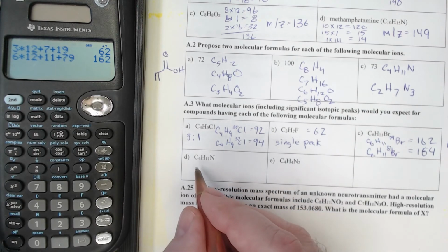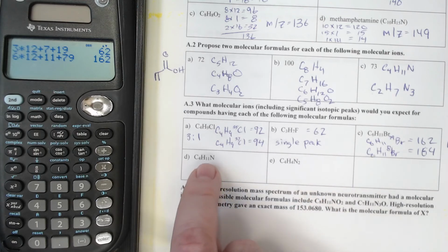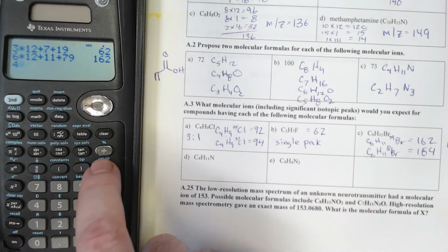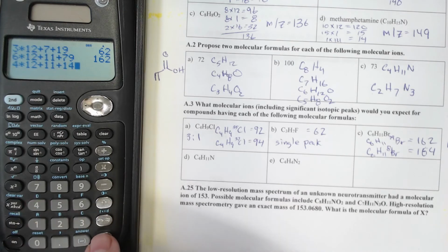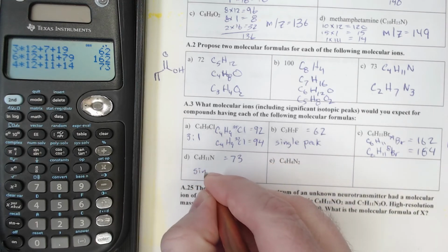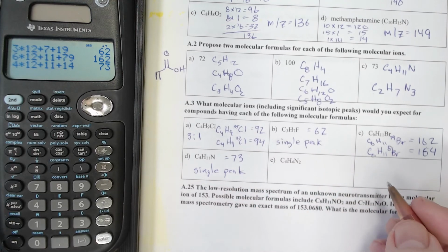All right, next, let's look at this one, C4H11N. This should be an odd number because it has 1 nitrogen in it. So 4 times 12, that's 48, plus 11, that gives us 59, plus nitrogen is 14, and so that's going to give us 73. So this one should have 73, and it should be a single peak. We shouldn't have an M plus 2 peak on that.